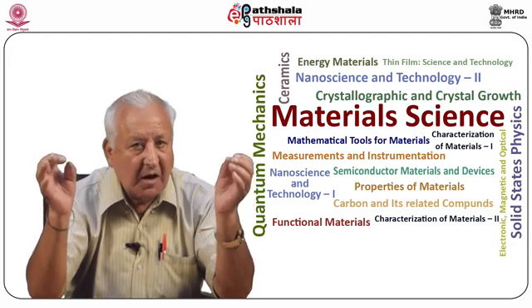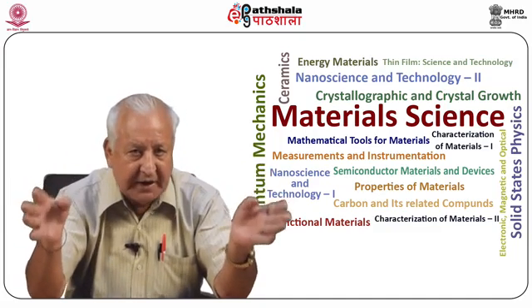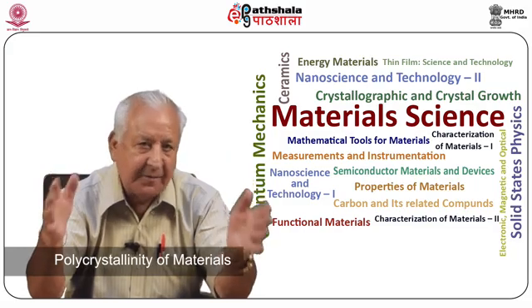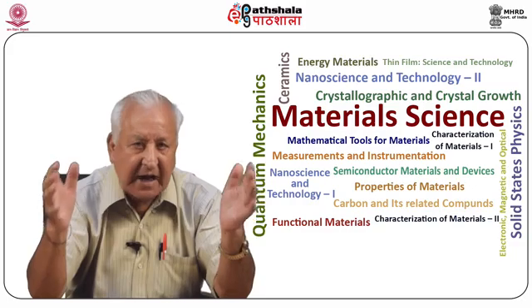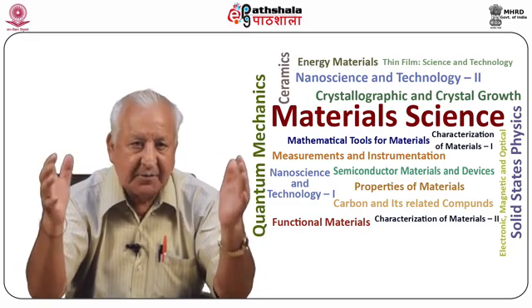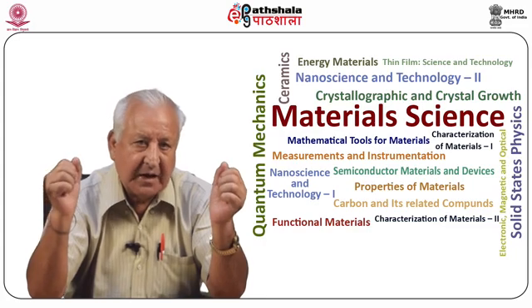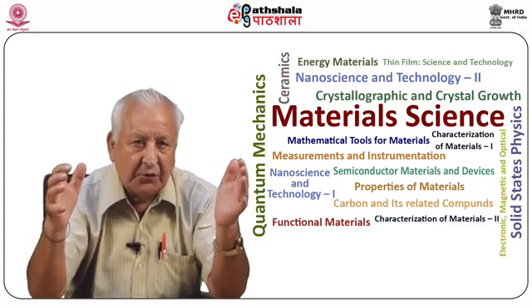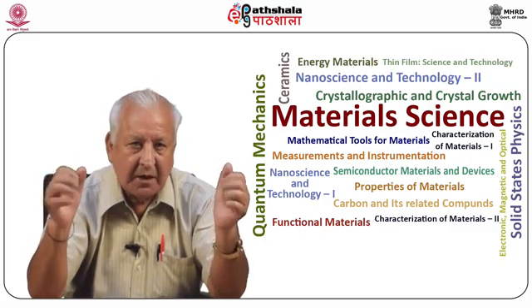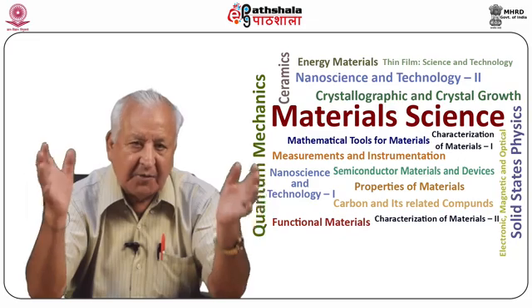Laue diagrams are used for determining the symmetry and structure of materials, orienting single crystals, and investigating distortion or polycrystallinity of materials. Thick samples can be used for the back reflection method, which offers the advantage of higher resolution as compared to the transmission method. Very fast diffusion transfer films and luminescent screens have been used, which to a very great extent shorten the exposure time required for Laue photographs. Films are being replaced by Geiger or scintillation counter techniques coupled with data processing equipment.